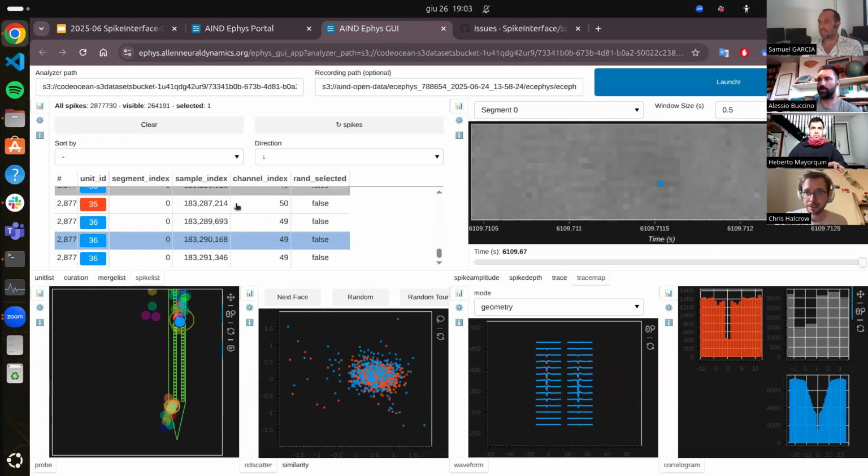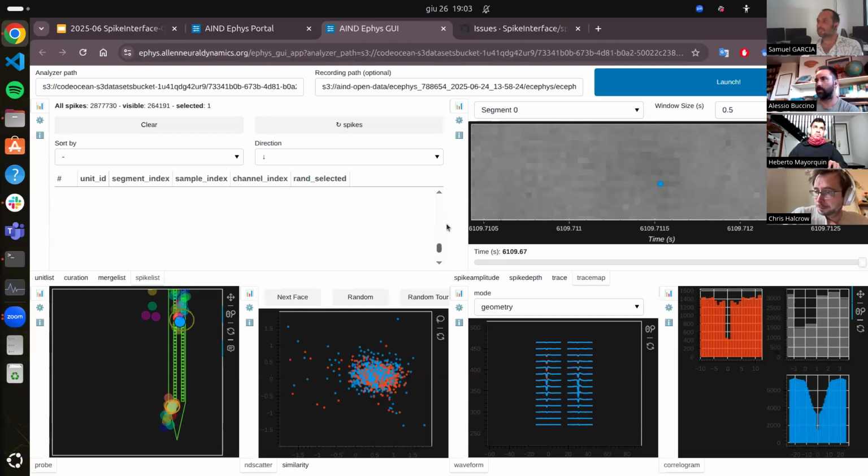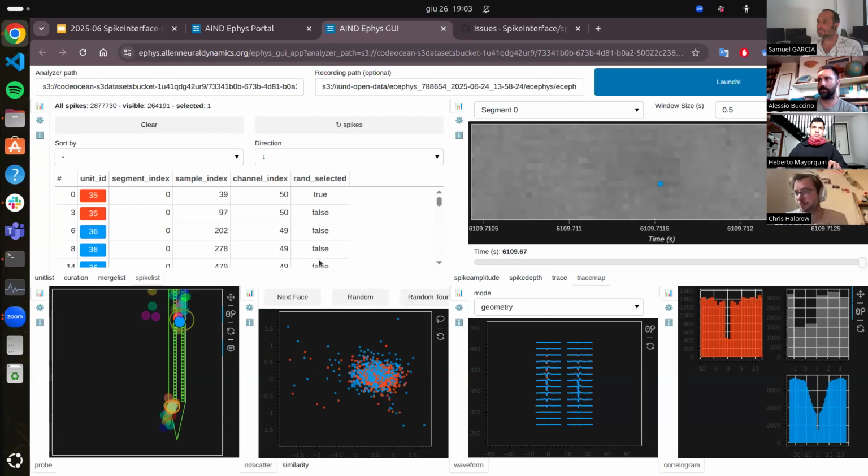Yeah, so this is just to show that this can be customized as needed, but it's very flexible. So we can add a bunch of information that we want. And this is really pushing the boundaries of manual curation. All this data is fully remote and fully sitting in the cloud somewhere. And now we have a centralized way to explore the data, perform curation, and it's also possible to add plugins so you can talk back with some custom functions to databases and stuff.